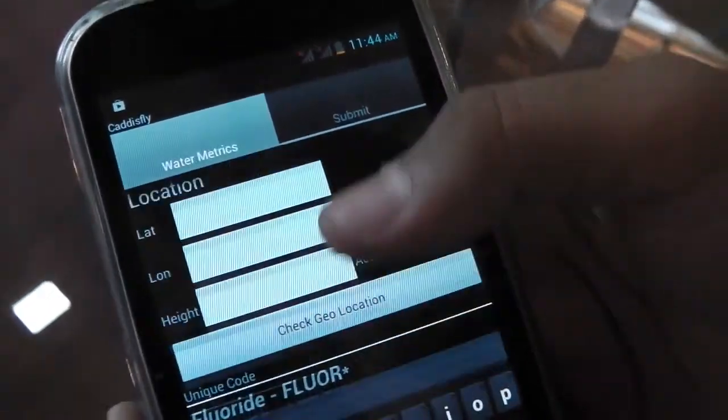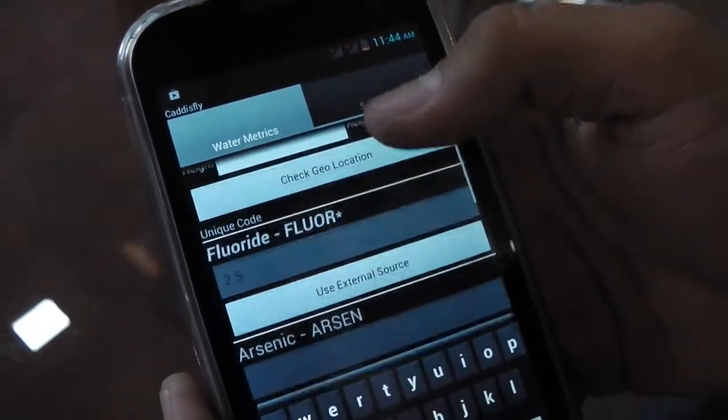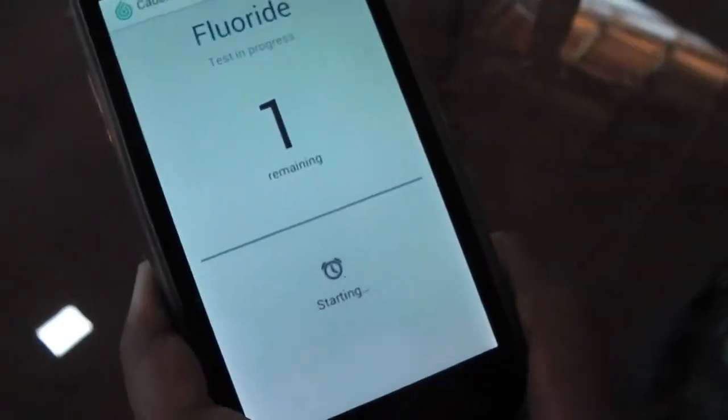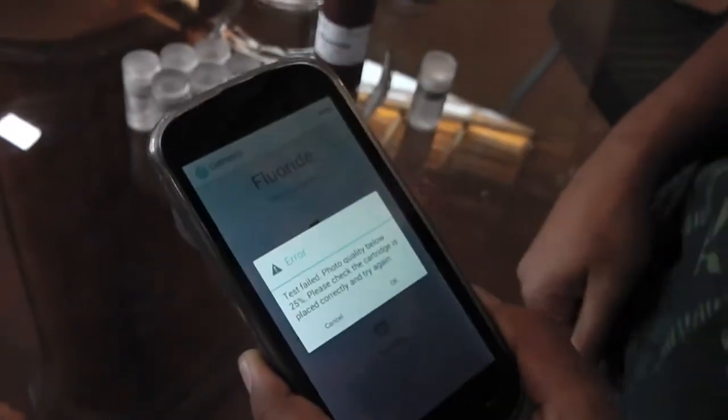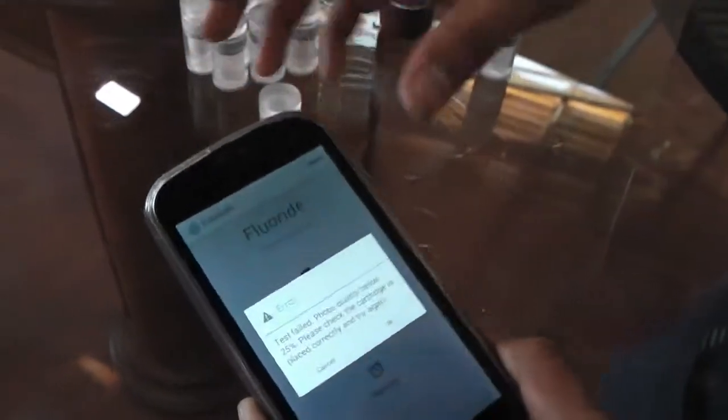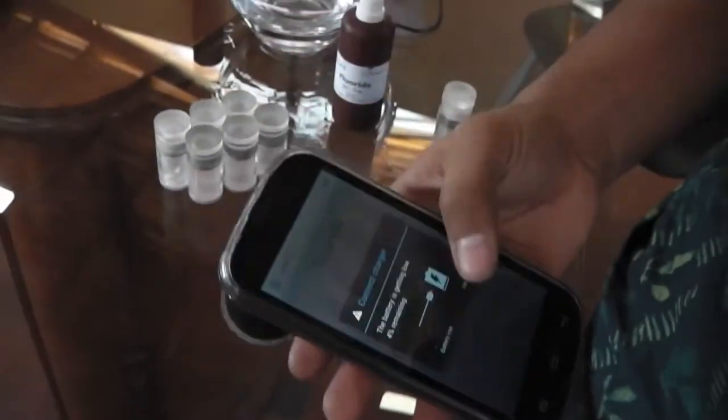Once you input all the details, you use external source, and it'll go to the Cadizfly fluoride test. You can run the test from there. Right now I forgot to turn it upside down, so that's why it's going to error.